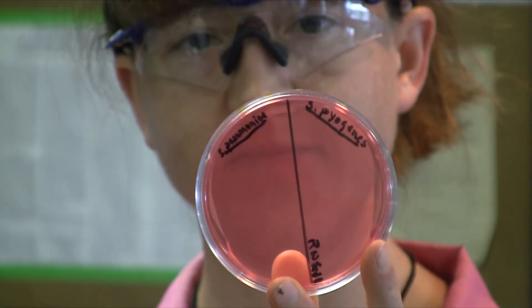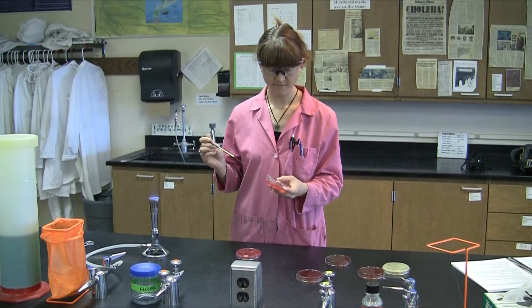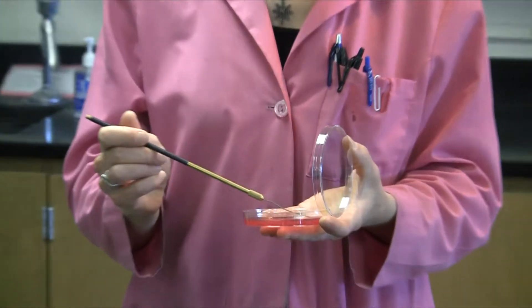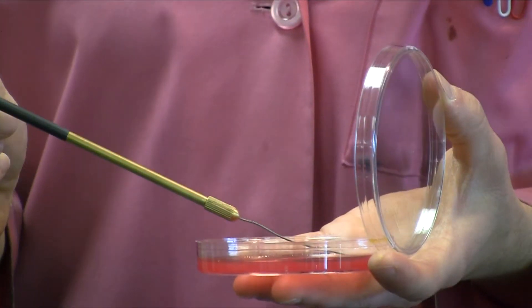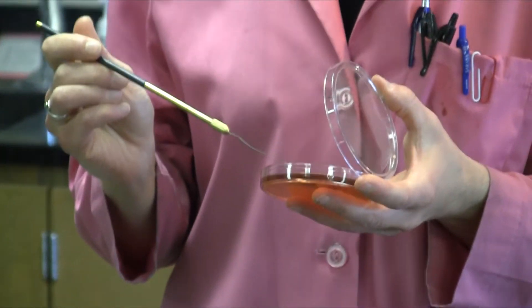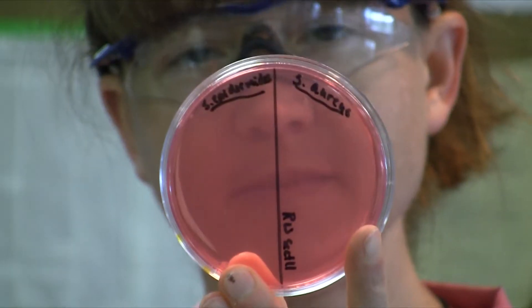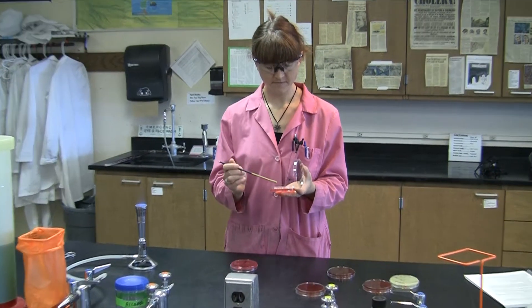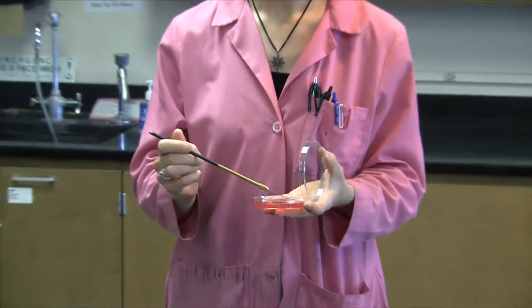So in order to inoculate the plate, we're going to simply be streaking on half a plate — I like to call it half-ass streaking. You'll take your initial inoculum and put it heavily into the primary area on half of the plate. From there, you can flame your loop and simply streak into the second quadrant the way that we would on a full T-streak, but you're doing it on only half of a plate.